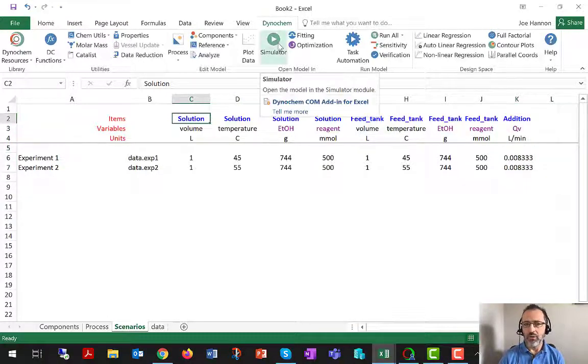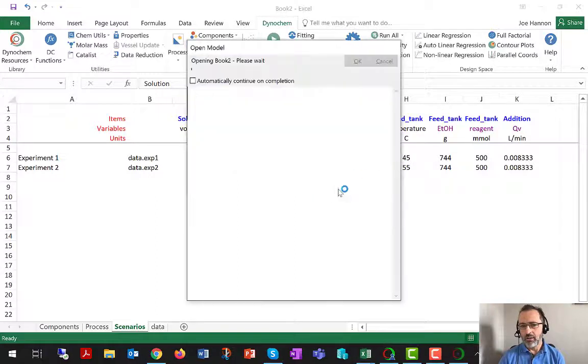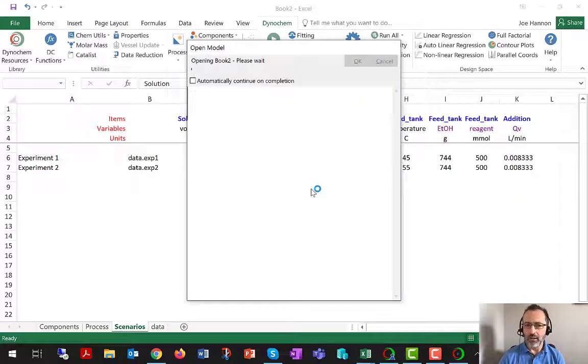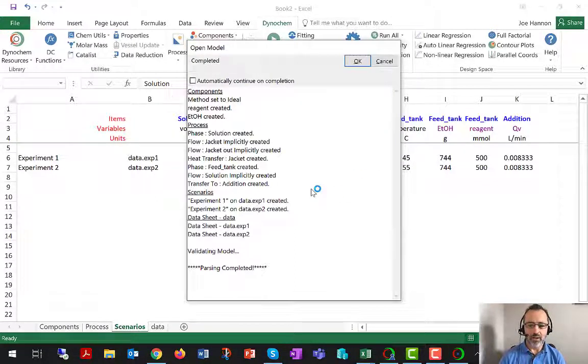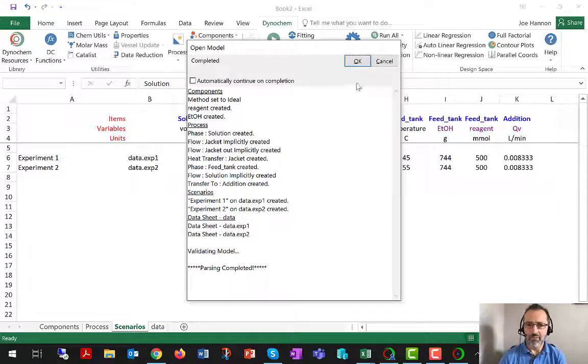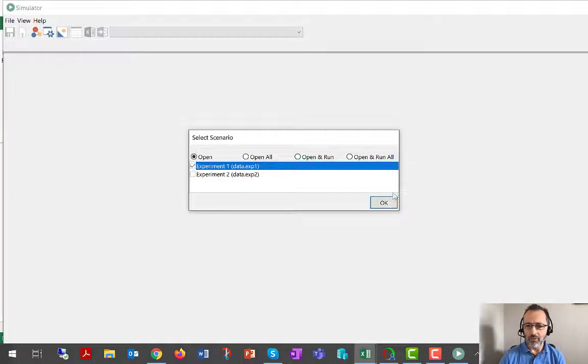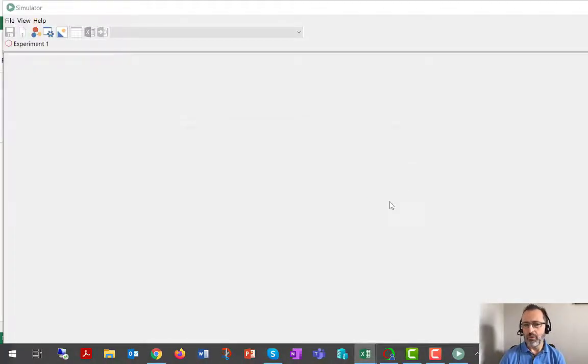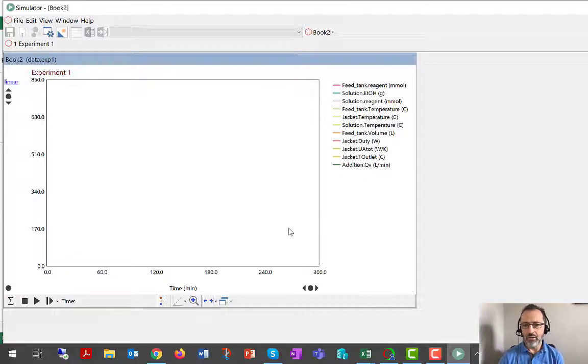If we now run in simulator, there will be again a consistency check to see that everything is self-consistent in the model. And if it is, we get the OK button and can proceed to the simulation environment.